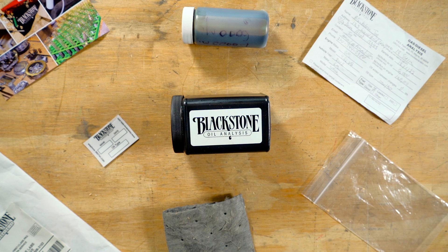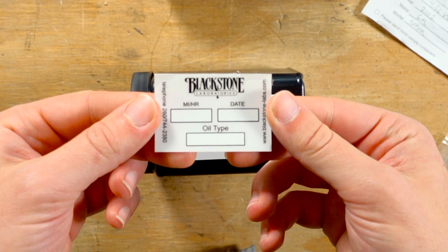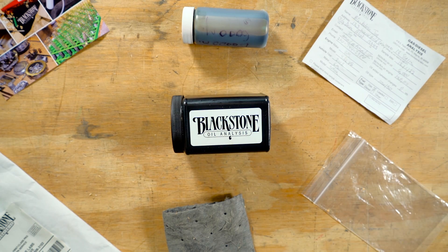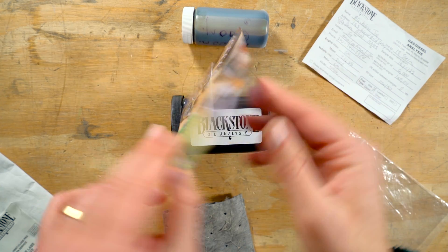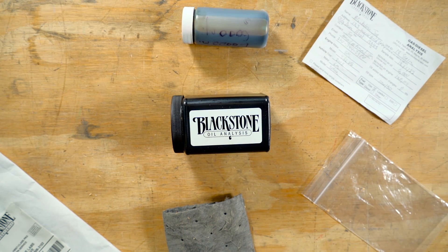Here is our oil analysis kit, disassembled. Included in your kit are two elements that you do not need to send back. The first of these is a window sticker. Secondly, we have an instructional sheet with some helpful do's and don'ts, as well as some patented Blackstone Humor. Be sure to give that instructional sheet a read through before you begin packaging your own sample.